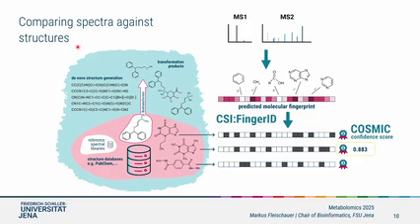And this is a very flexible and powerful approach, and it does that by using a so-called molecular fingerprint. And the interesting thing is, with this approach, you can basically have structures from any various sources. So if you can draw the structure, if you have it in a structure database, if you have it in a spectral library, if you compute some transformation products, you can all throw it into it.